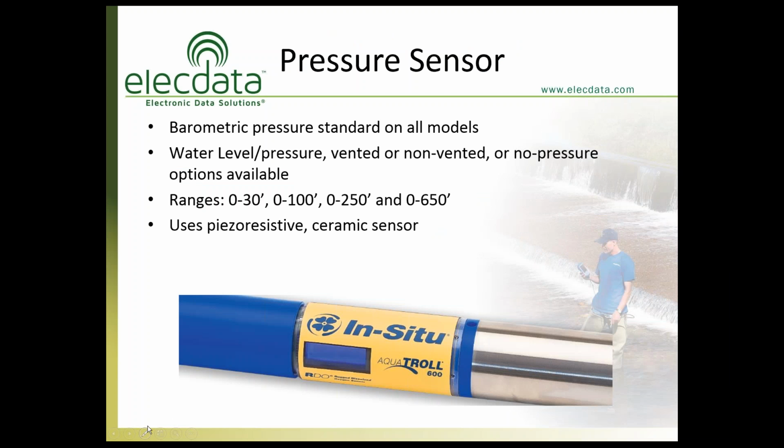If I can get my slides to advance, that is. Okay, let's talk about pressure sensors within the AquaTroll 600, because essentially if you count the barometric pressure sensor, you can have two of them in there. So barometric pressure is standard on all models. I'll talk about the importance of that in a minute. In addition to having that barometric pressure sensor, you can also choose to have an internal water level pressure sensor installed, and you can have your choice of a vented or a non-vented sensor when you're doing that.